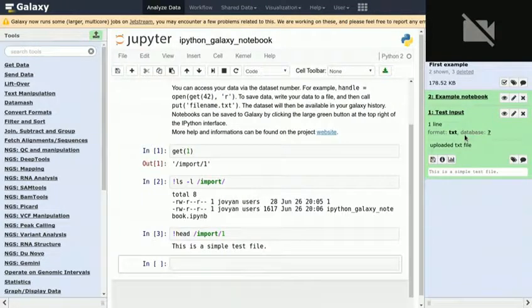Because it's the same child. Okay? So this notebook has copied the file with the ID 1 into the Docker container. That's it. But please remember, it's a copy. So if you have here a huge file with 30 gigabytes, that could be large. So this analysis is really meant for explorative research. You shouldn't do mapping inside this notebook. I mean, this is where Galaxy comes into it, right? You can, yes. Don't do it.